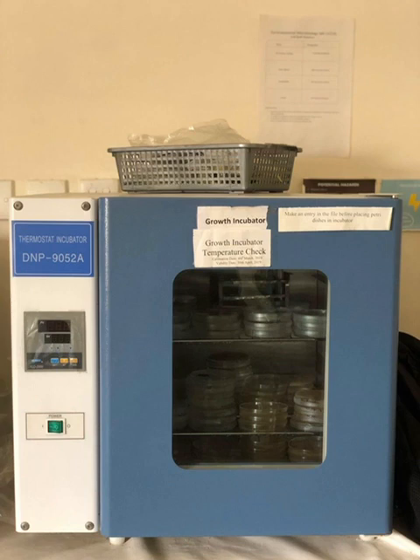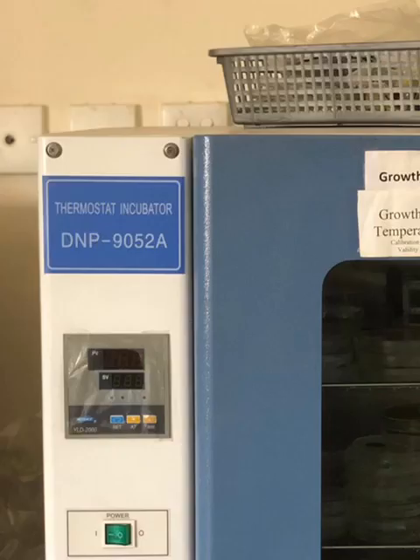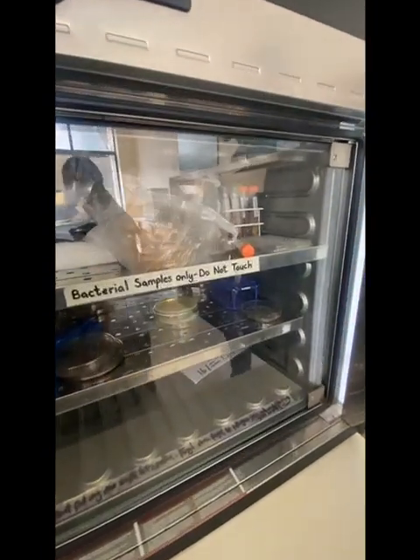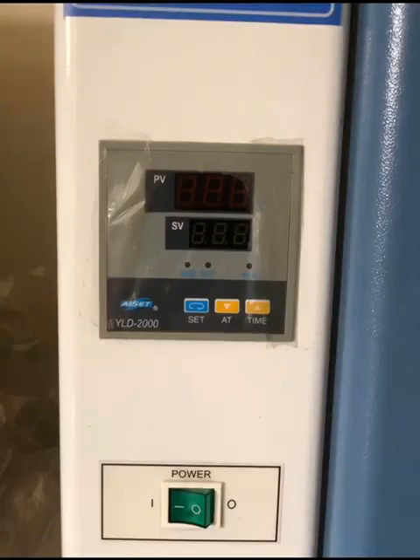A thermostat incubator is often referred to as a growth incubator. These terms are sometimes used interchangeably, especially in the context of laboratory equipment designed to provide controlled conditions for the growth of microorganisms or cells. While the term thermostat incubator emphasizes the temperature control aspect, the term growth incubator may encompass a broader range of features and functions, including humidity control, gas composition control such as CO2 and O2 levels, and sterility maintenance, depending on the specific requirements of the cultures being grown.